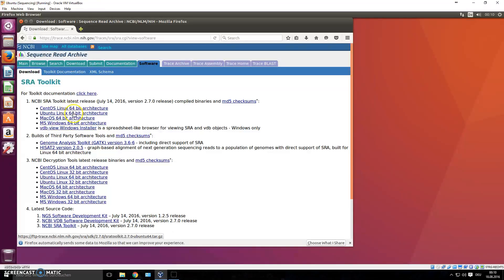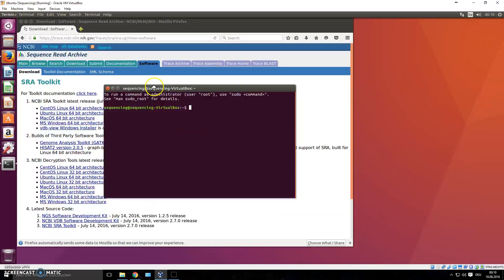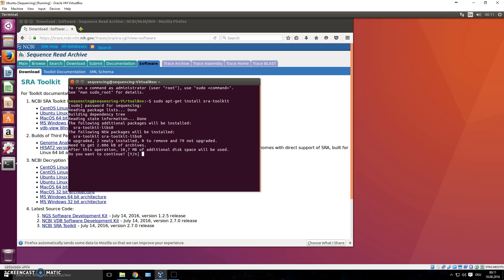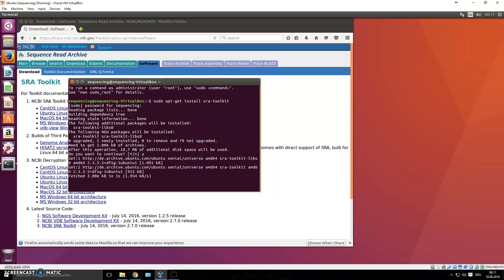There's a much easier way to download on Ubuntu. Open up a terminal and type the following command: `sudo apt-get install sra-toolkit`. The `sudo` gives you administrative rights to install things. This will automatically download the whole toolkit for you, since Ubuntu is already connected to a repository of packages. It will ask for your password, then ask if you want to use about 10 megabytes of additional disk space. Click yes and it will download and install everything for you.